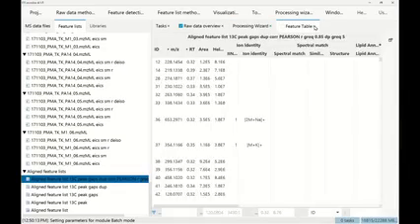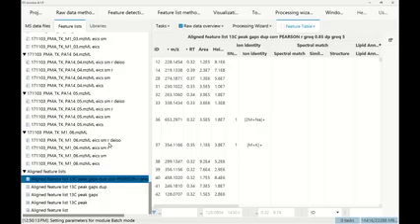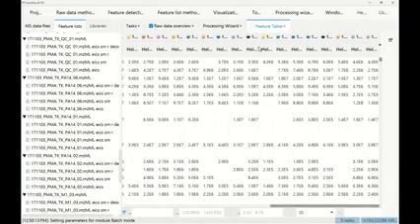So everyone who wants to follow along, the last feature list with the longest name is typically the one that you'll want to look at. It's the aligned feature list. If we look at the feature list here, we're also going to see all the samples. They are color-coded. Because we have so many samples, if we now visualize something, some colors are going to be doubled. But of course, it's quite hard to visualize.